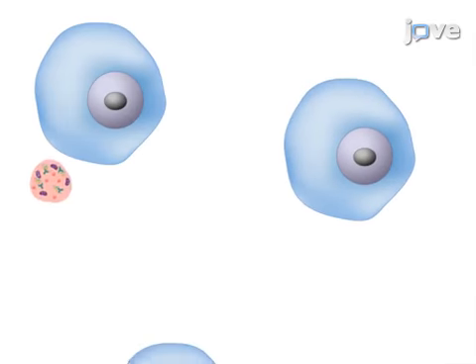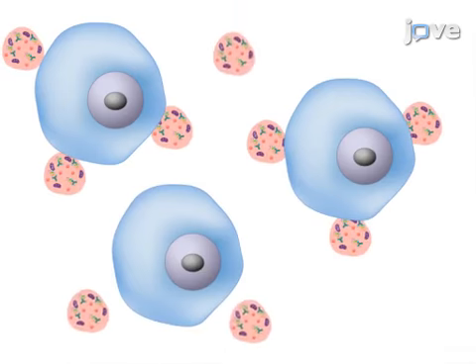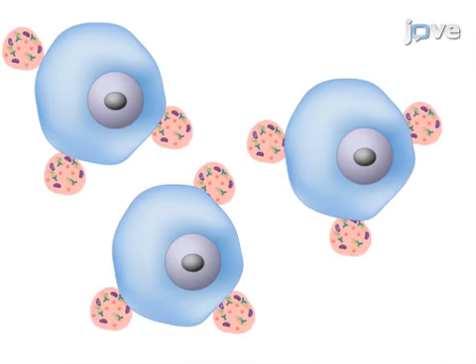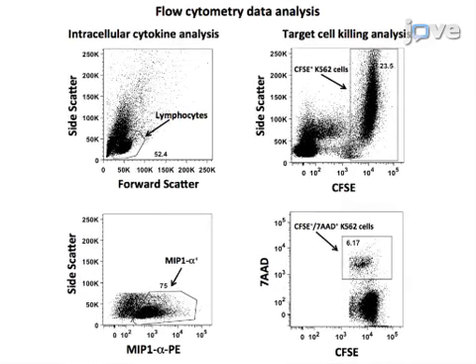Alternatively, CFSE-labeled K562 cells are co-cultured with whole smoke-conditioned medium-treated PBMC effector cells, and the viability of the K562 cells is quantified by 7-AAD staining. Ultimately, the effects of the combustible tobacco product preparations on the PBMCs from either assay are measured by flow cytometry.